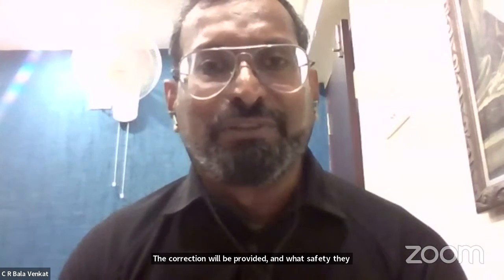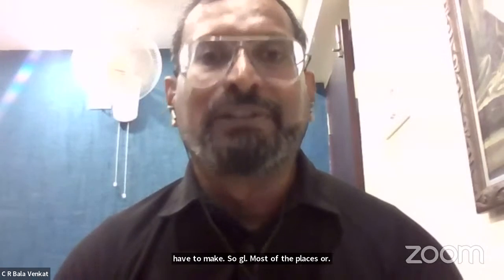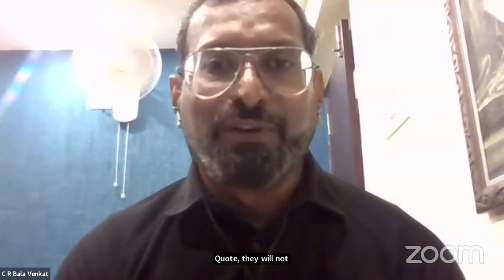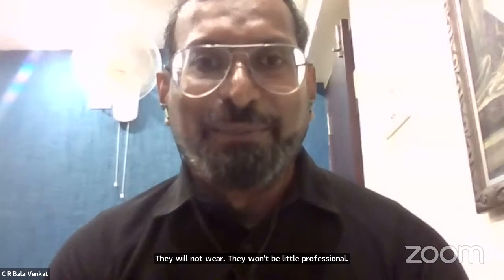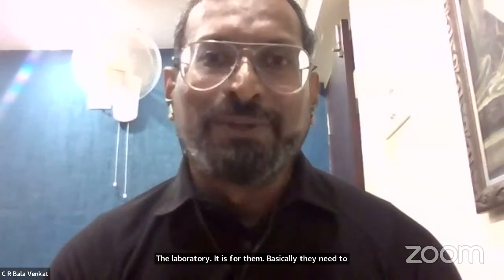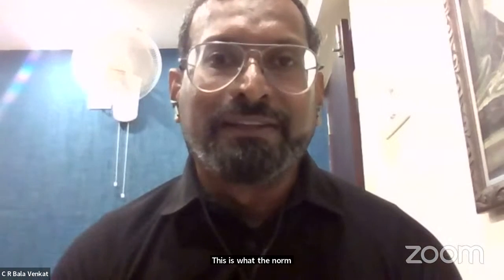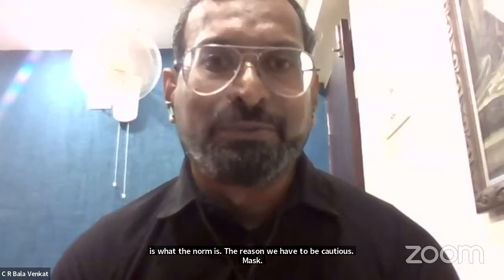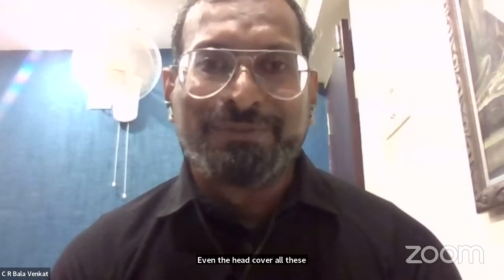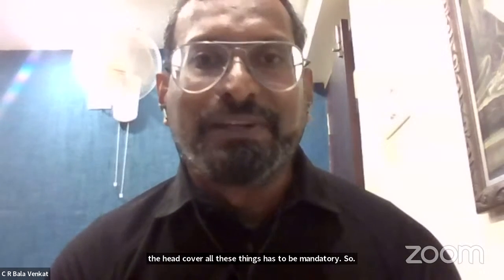In most places, they will not wear gloves or a coat. They are not being professional. This is not for the laboratory, it is for them. Basically, they need to understand, for each individual, these are the norms. That is the reason we have to be cautious. Mask, even the head cover, all these things have to be mandatorily followed. We cannot predict uncertainty, so it is better that the samples are handled well.